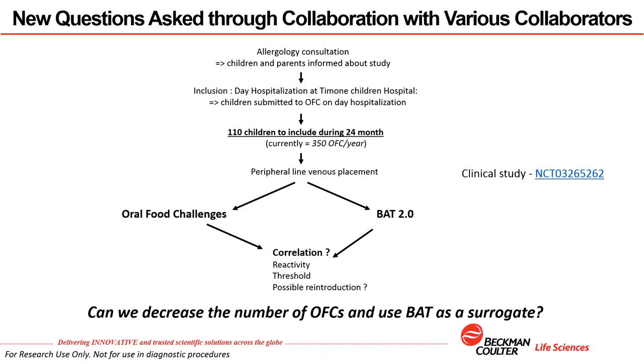And just as a way to illustrate what we're doing in this field, I wanted to share a few slides about the clinical study that we're taking part in, thanks to a collaboration with the University Hospital here in Marseille, in the south of France. The question that this clinical study tried to answer is whether the number of oral food challenges can be decreased thanks to a potential use, of course, down the road in the future, of basophil activation testing as a potential surrogate method.